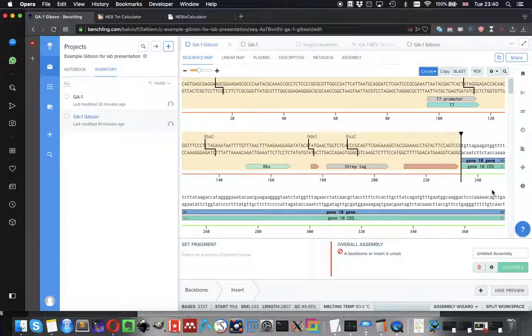The reason why we do it via Benchling is that Benchling is going to calculate the correct primers via the Primer3 algorithm, and will determine the correct melting temperature and the correct length for those primers with the optimized settings that you give it.